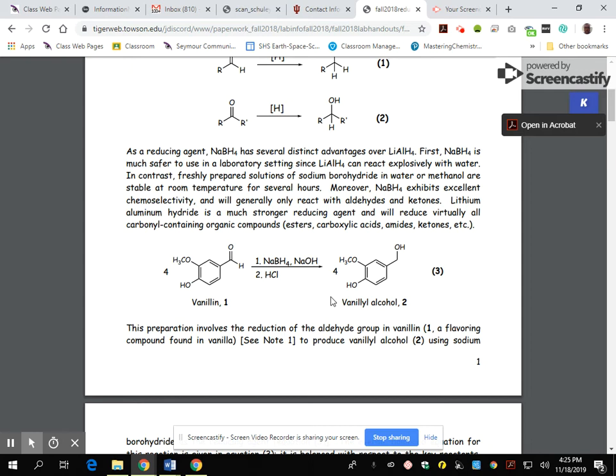Of course, this is modern day and age, and when this book was first printed, the proliferation of the internet was not as good. So my guess is you're probably going to be able to very easily find some procedures that will be legit. I'm going to give you some parameters. You're going to have to stay with them. And if you'll notice, this example I'm giving you from another university is showing you probably the chemicals you want to use.